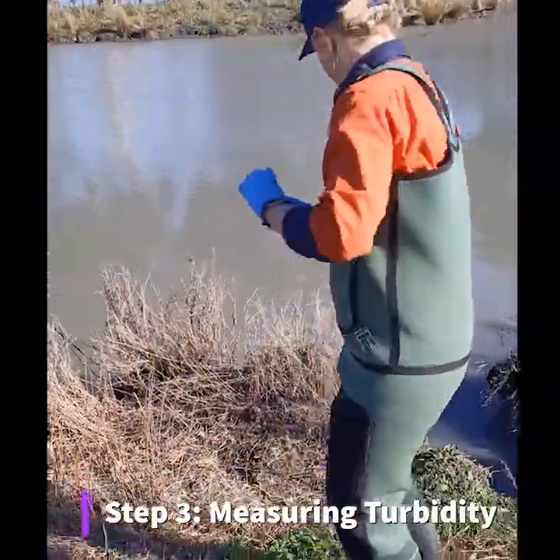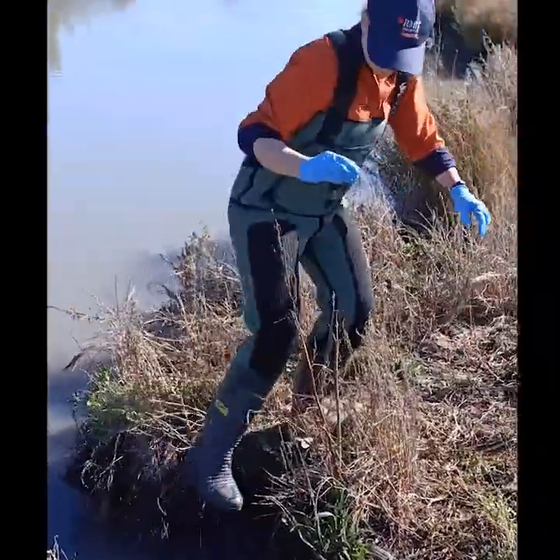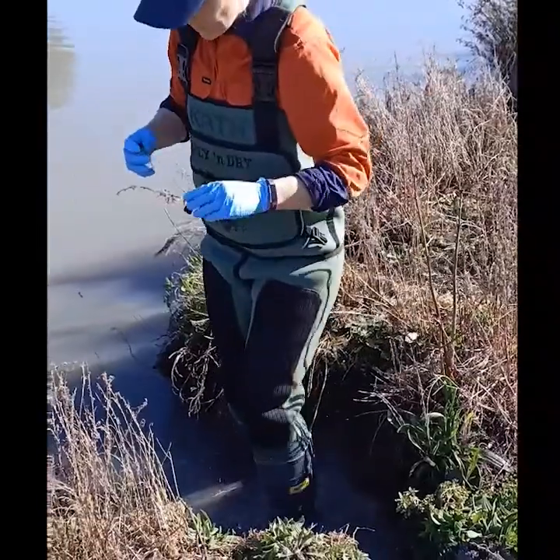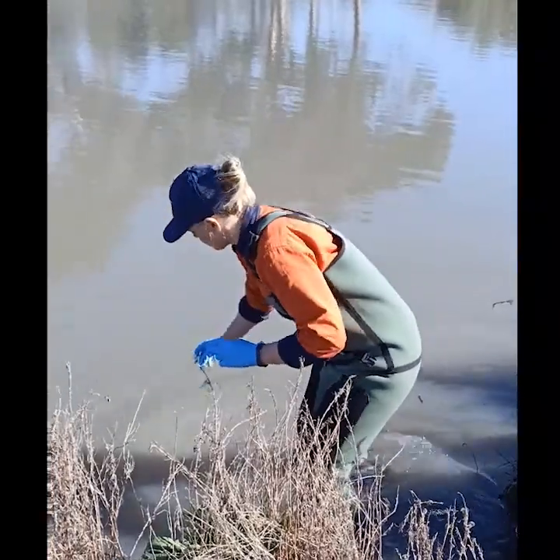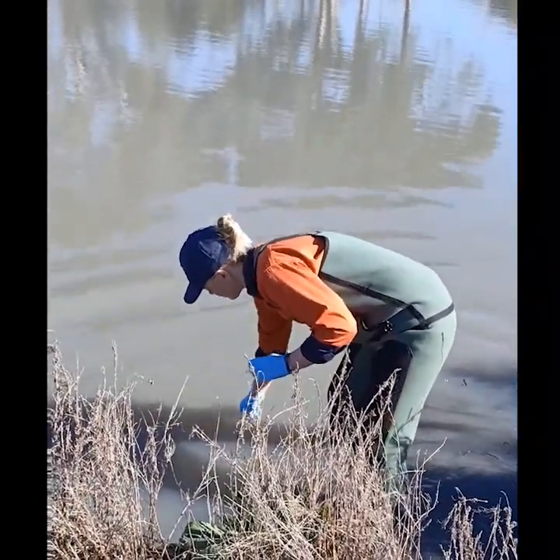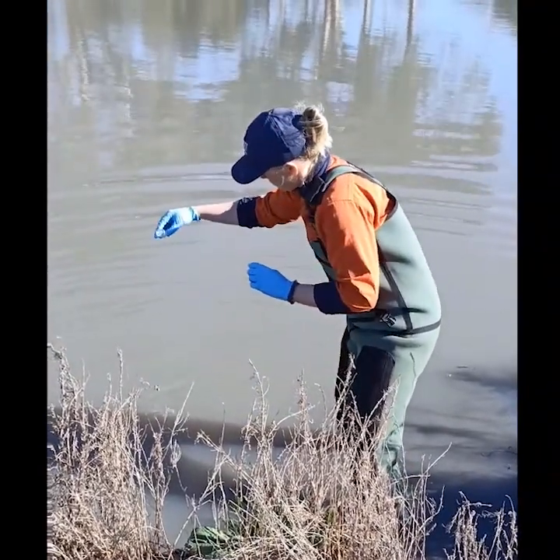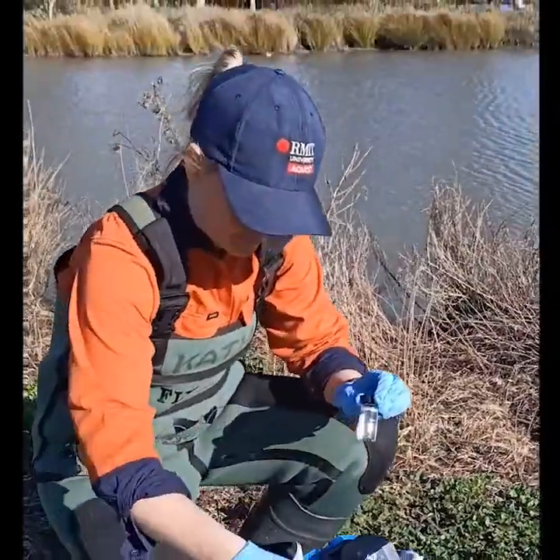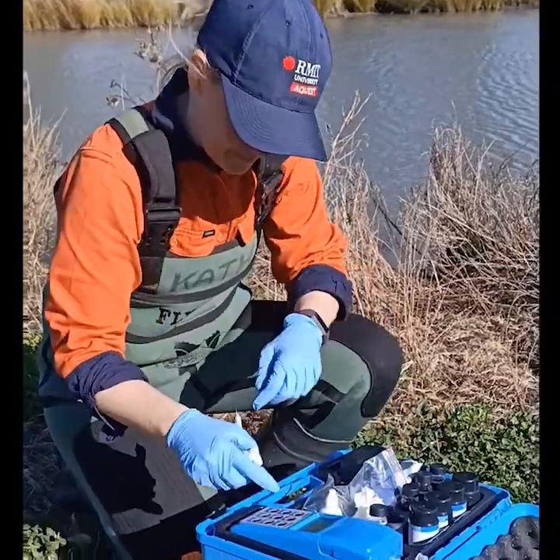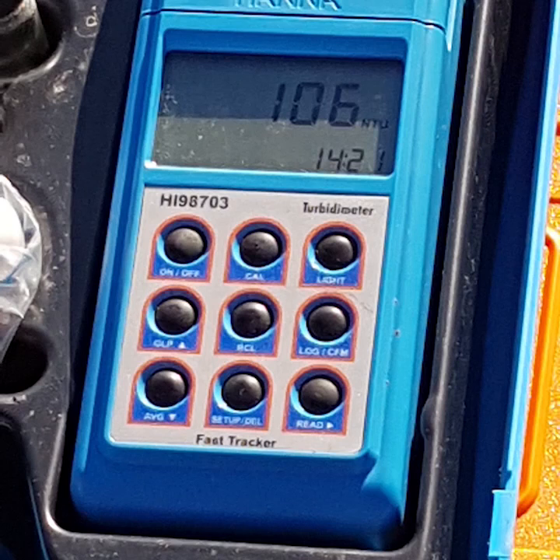Finally, we will look at how to take a turbidity sample and measure it. So you start by getting your glass container or vial to get the sample of water. You go into the water and make sure that you rinse the container a few times before collecting the actual sample. Take your sample again in an area that hasn't been disturbed and bring it back to put it into the turbidity meter. Clean off the water on the outside of the container and place it in the meter to get the reading. So the turbidity of this wetland is 106 NTUs.